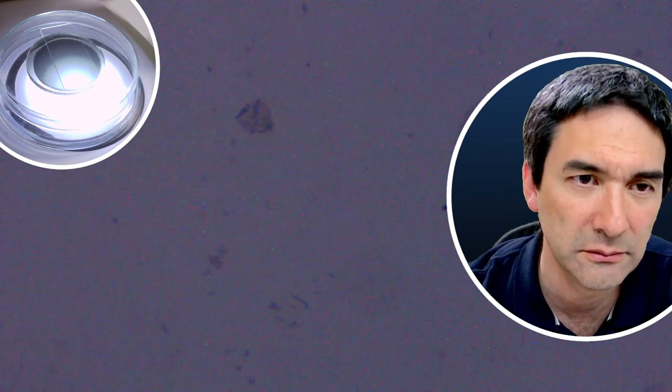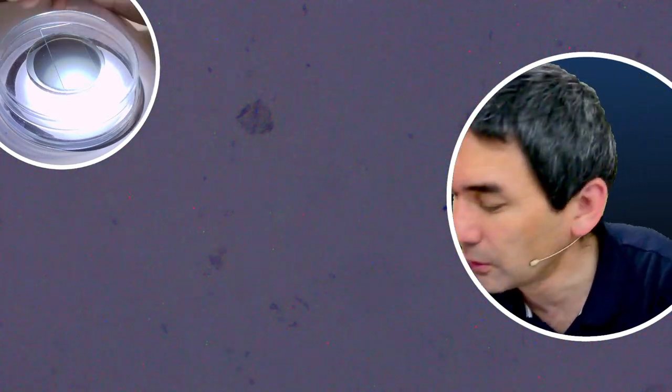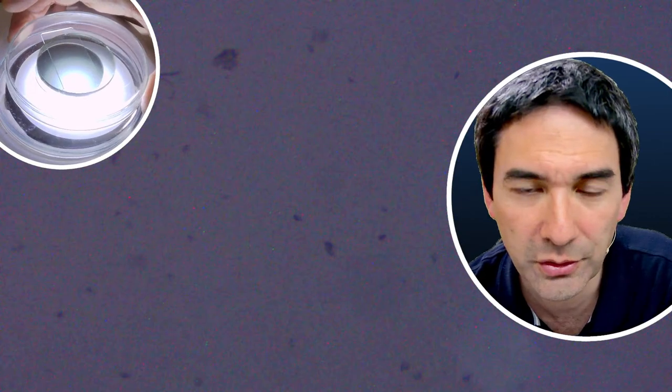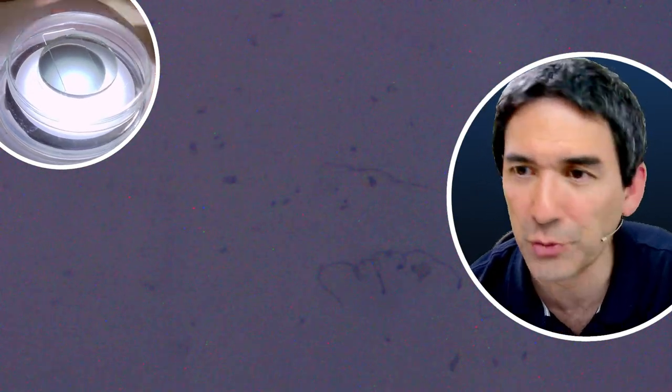Nah. Okay. I think we can conclude that they're not very suitable for polarizing microscopy. Okay.